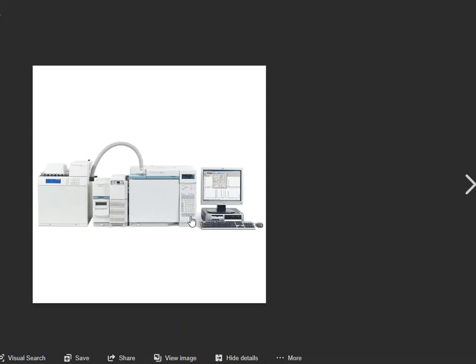So again, this is my KitchenAid mixer right here. And the Headspace unit would be another paddle or another attachment that I would attach to that mixer to maybe change its purpose or to do something a little bit different with it. The box here in the middle, who knows really what that box is? It's probably another type of detector. It could be maybe a hydrogen generator, but honestly, it's probably another type of detector that's connected to this GC box. All right. Okay, so there's the story with the Headspace.